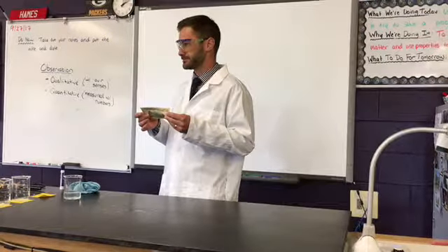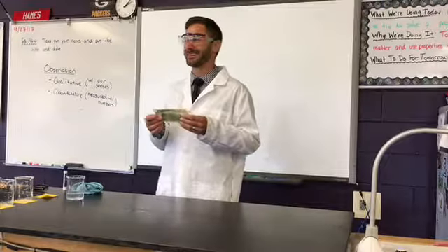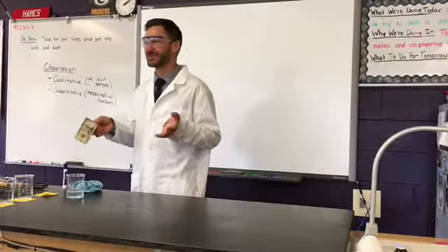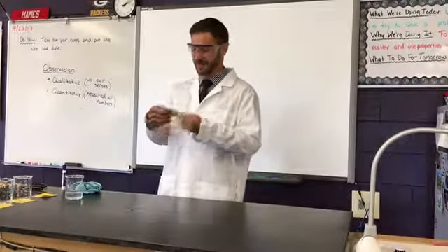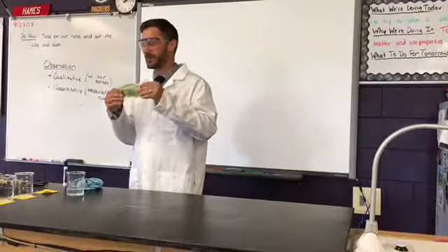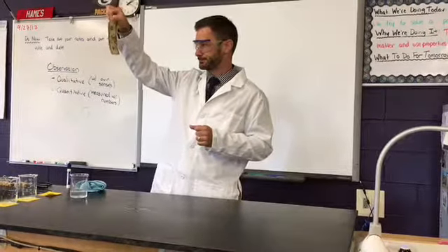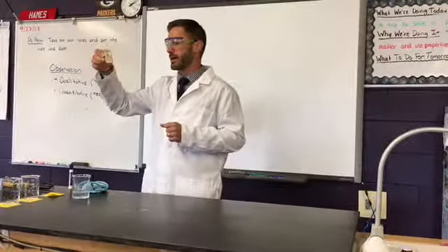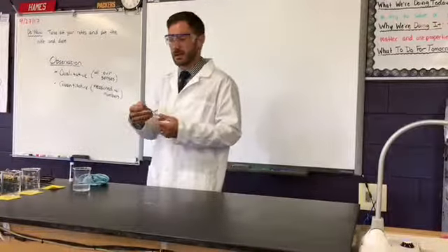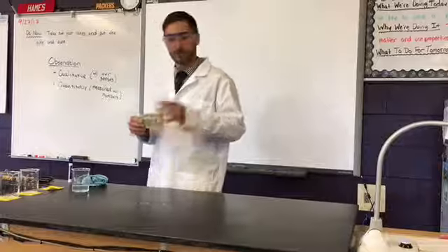Evan. Do the waft. Yeah, anybody want to do the waft? You can do it. Everybody's so good. So I'll do it. I smell it very faintly, but it barely smells, which means probably most of what's on this is water. Okay. We are going to still speculate that, but yeah, it's more than likely water. Okay. All right, we're going to stop right there.